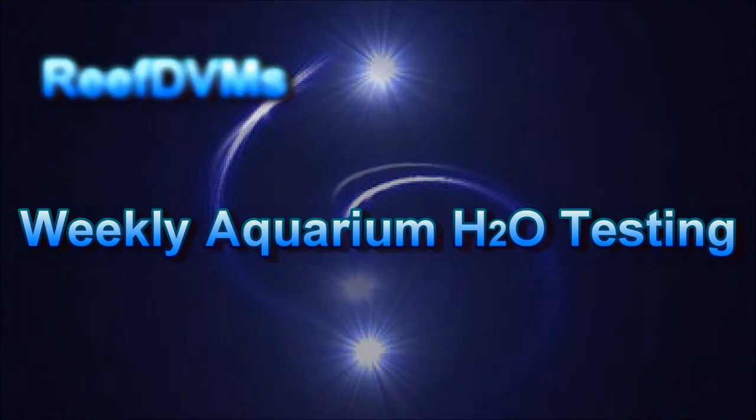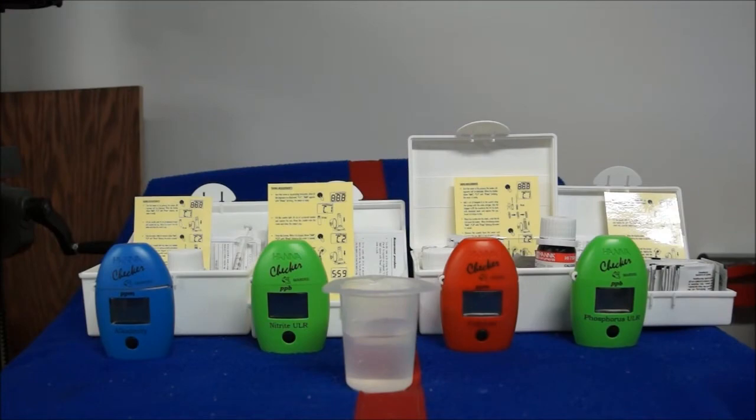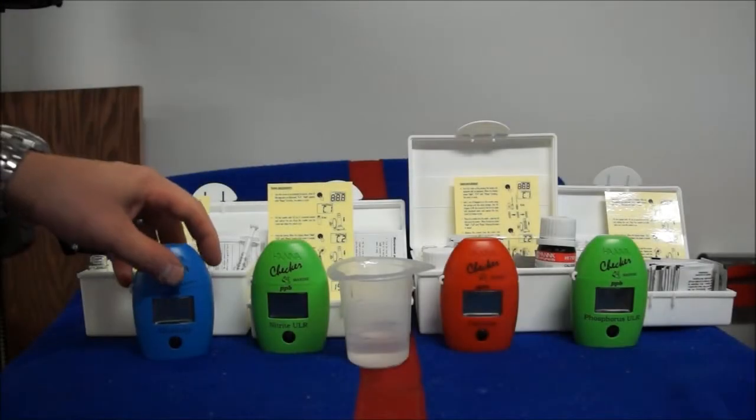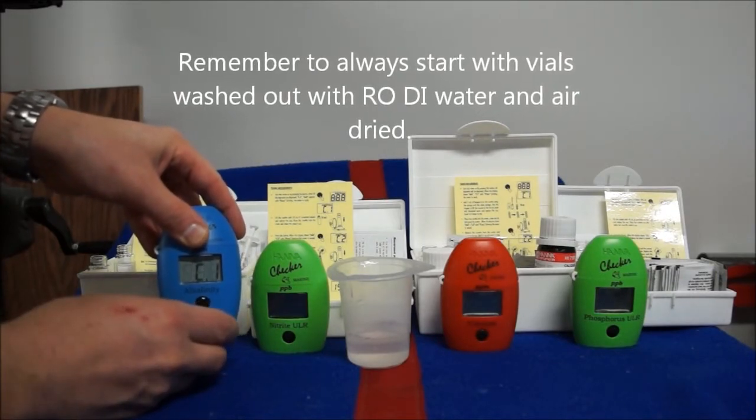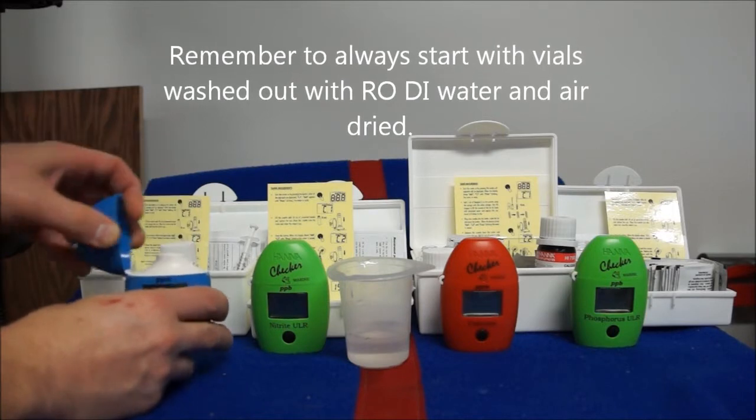Hello everyone. Today we're talking about weekly aquarium H2O testing and in particular what we do. We do four tests: alkalinity, nitrite, calcium, and a phosphorus test which is basically our phosphate test.